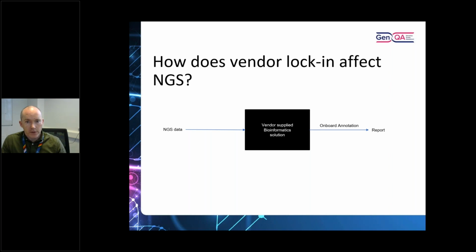But the problem with it is, let's say, for example, you buy a server from a vendor, I'm not going to name any particular vendors, or you put it on their cloud solution, and they do all the data processing for you. You're locked into them for, well, forever, really, for as long as you need to get access to that data and be able to retrieve it. That's definitely the case for cloud.